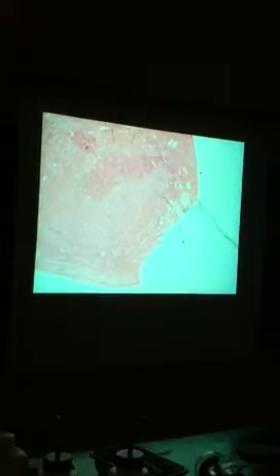All right, for the corpus luteum, not a great one, but if you look toward the right-hand side, do you see a difference from the left-hand side? It looks like a circle, a little area there, with a dark splotch in the middle of it. Move it over this way. Starting from there, moving over, all that section right there would be more considered a corpus luteum. It looks a little different than the background.